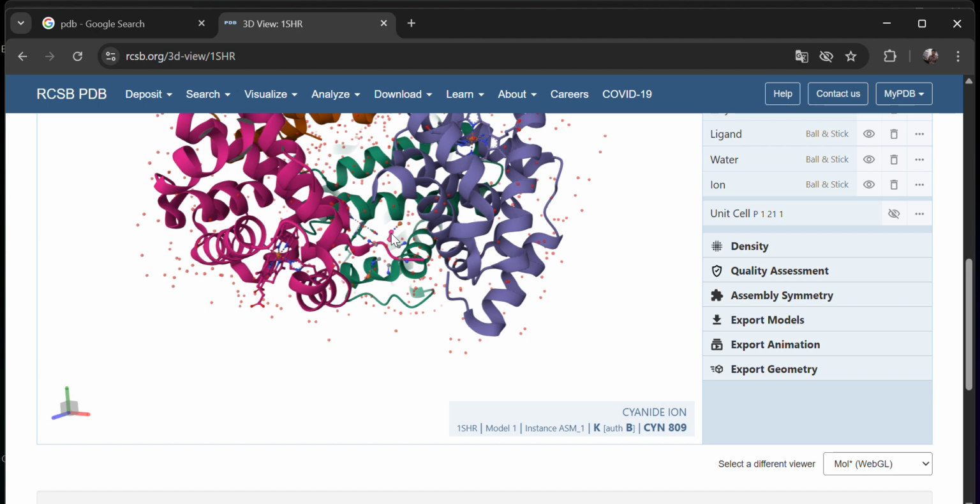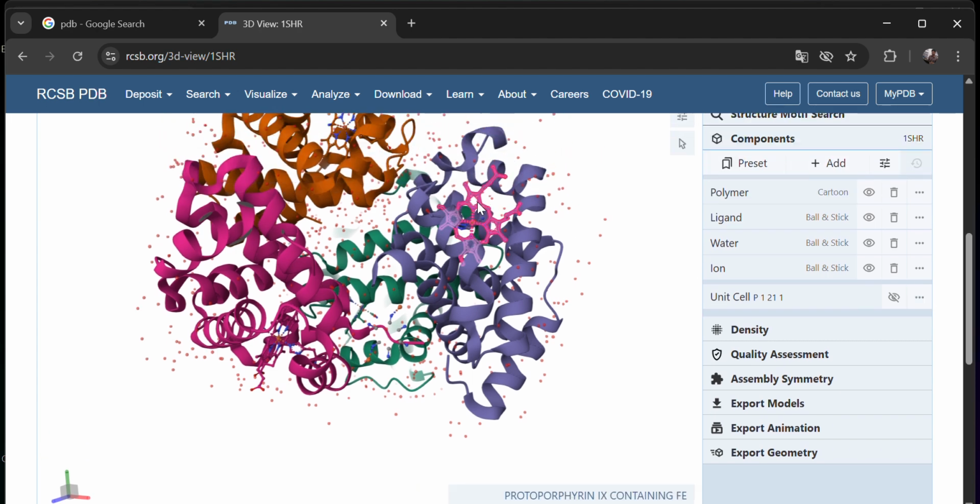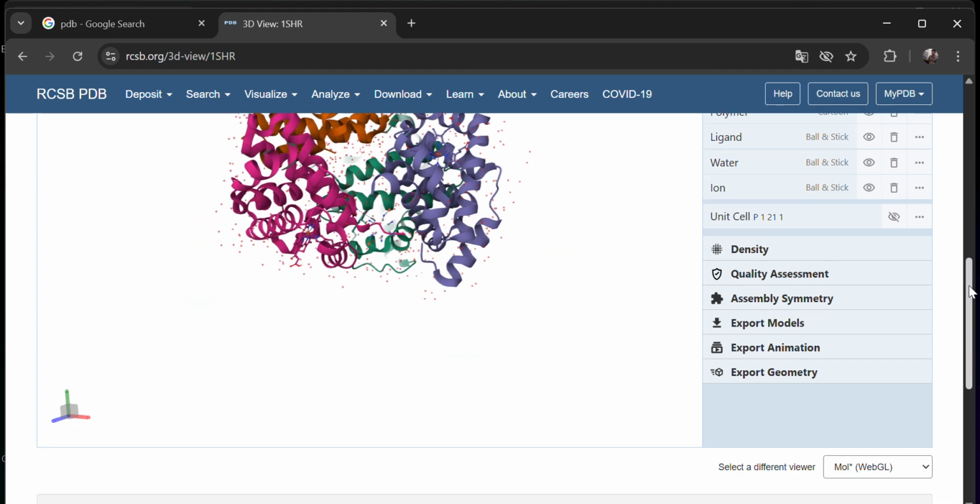So in this way you can take a snapshot by searching the polymers or ligands and water molecules. What kind of ligands are there, you already saw, right? You already knew that. So this is the compound containing ferrous, the ferric compound. So this will be shown, right? So you just zoom down and you can go and select that. See, one more molecule is there at the bottom. In the right hand side bottom, they will display whatever the cursor is denoting, right?